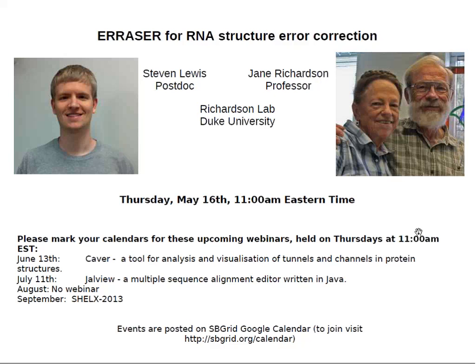Well, sure. Automation is never perfect. But at some point, this as a tool could allow people to refine at resolutions that presumably they wouldn't have been able to refine at before, or at least in a time frame that was reasonable for a postdoc or a graduate student.